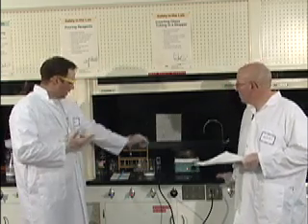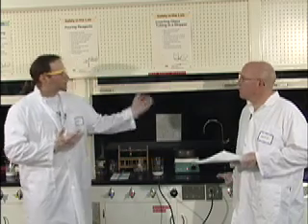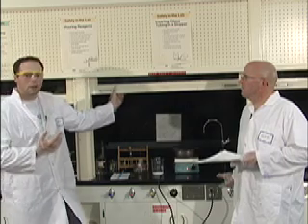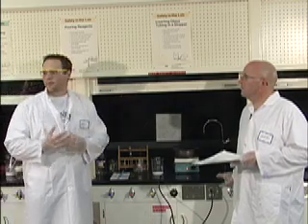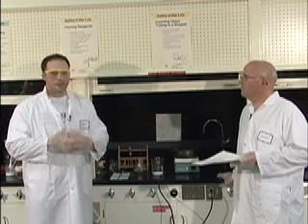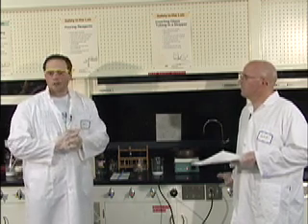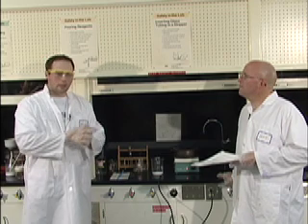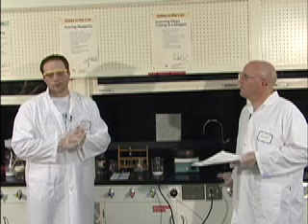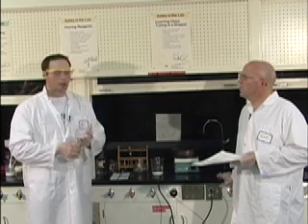Now, everything else for this lab has to be done in one of the fume hoods. You will be using acetic anhydride, which you will notice smells an awful lot like very, very strong vinegar. Acetic acid is vinegar, okay? So you want to keep these fumes in the fume hood. You'll also be using 12 molar sulfuric acid, which is extremely concentrated.